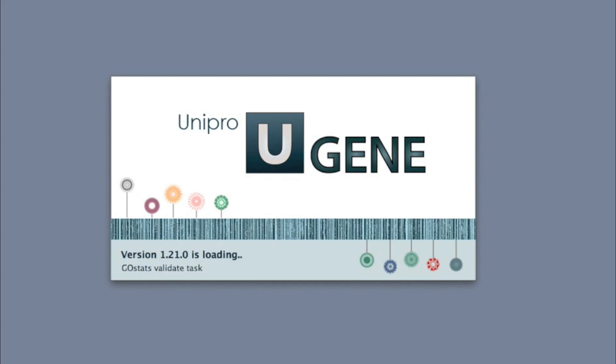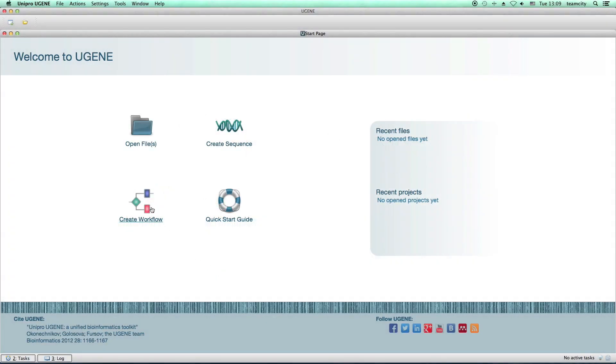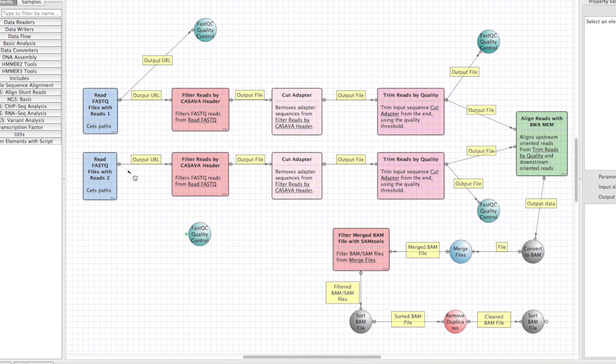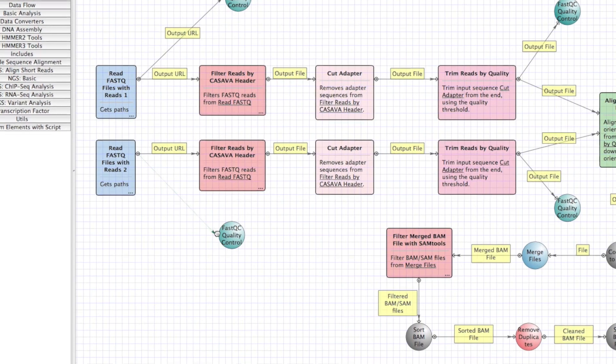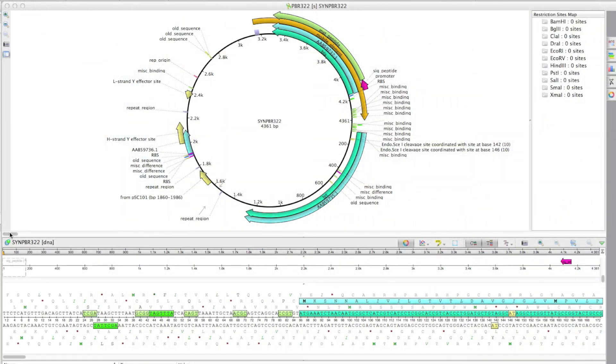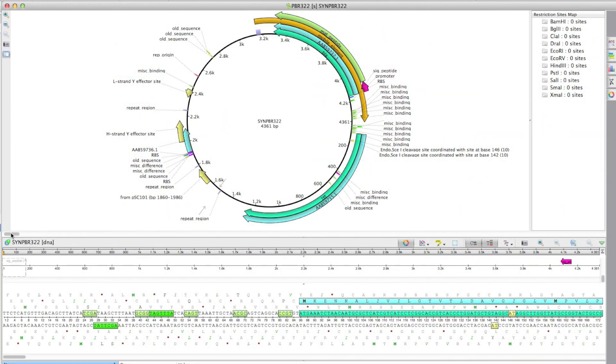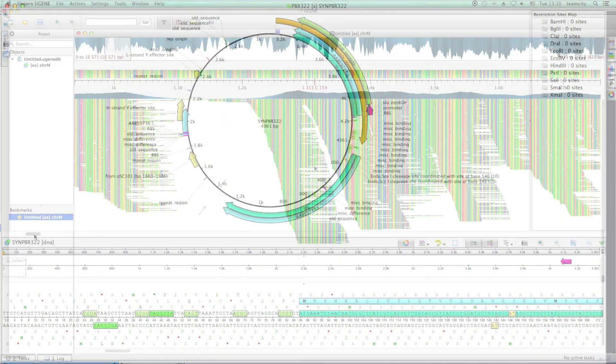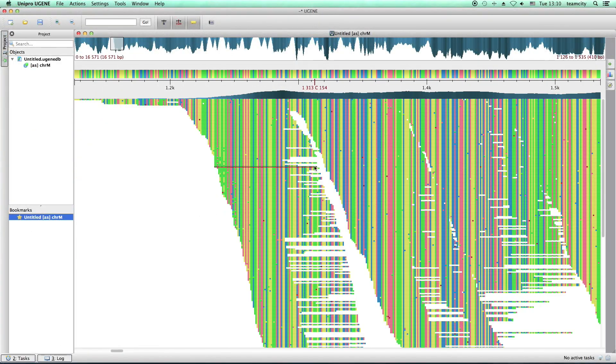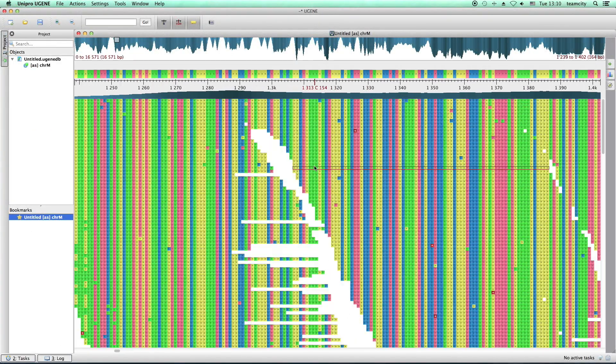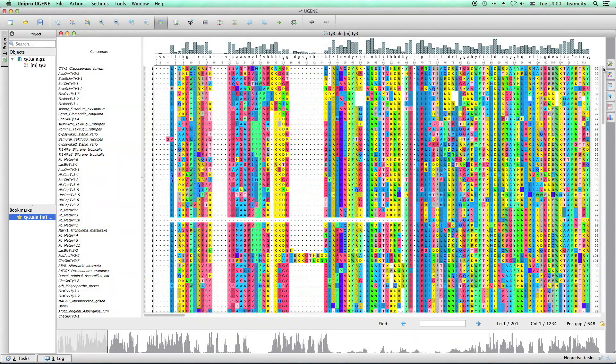Hello, you're watching a UniPro Eugene podcast. Here is an overview of the new features of Eugene versions 1.20 and 1.21.